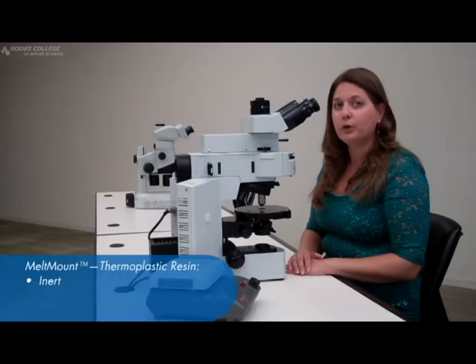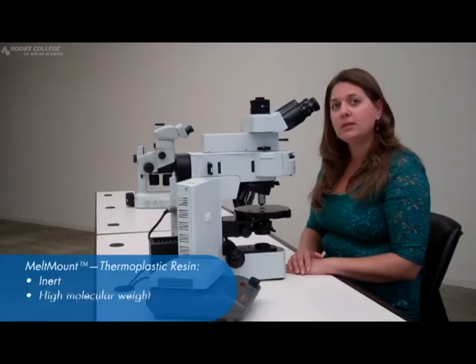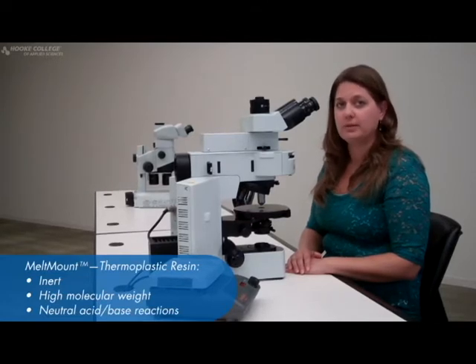Melt mount is a useful, fairly inert mounting medium. It has a relatively high molecular weight and is fairly neutral in terms of acid-base reactions.